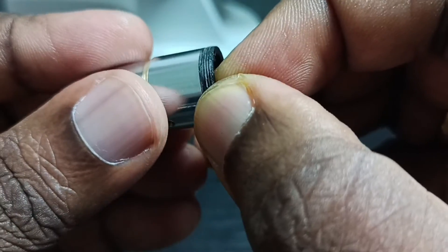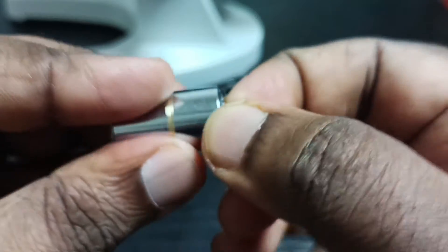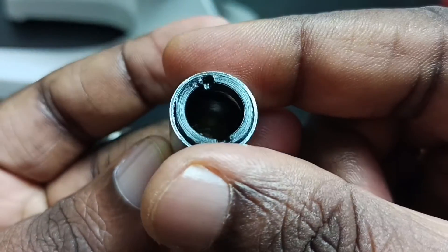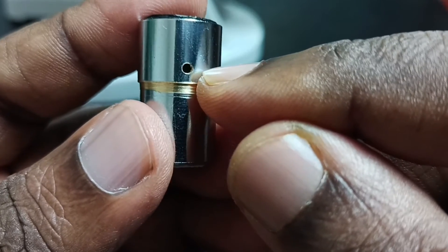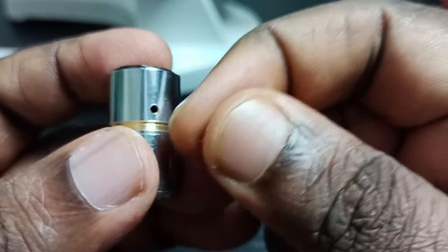This part is a little difficult. We have to carefully — you see, now we can just rotate it. It will go inside; we have to rotate it. Then we have to put this small screw here.